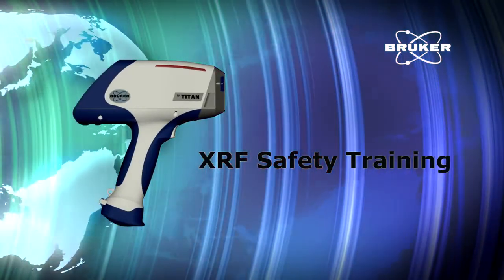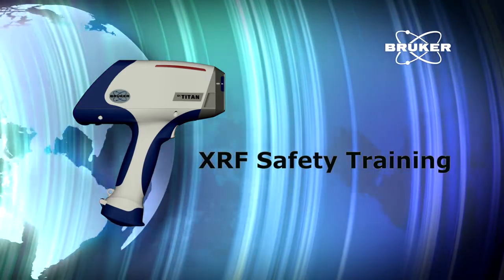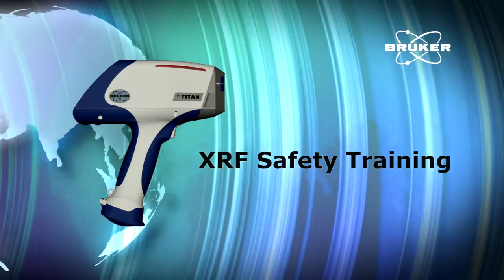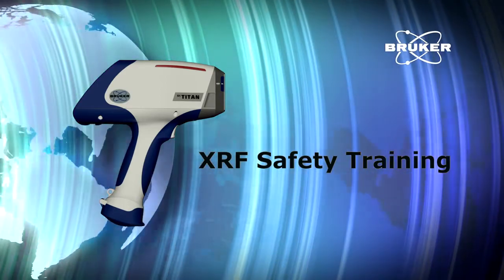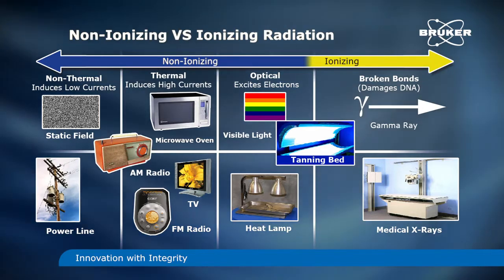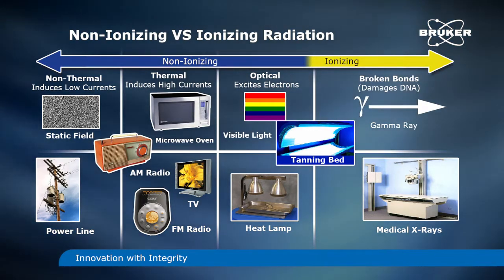This presentation is designed to provide the user with the general safety information relating to Bruker's handheld X-ray fluorescence (XRF) analyzers. Proper training is vital for compliance, safe operation, and understanding of the operator's responsibilities associated with handheld XRF analyzer use. The term radiation is used to describe forms of energy emitted as particles or electromagnetic waves.